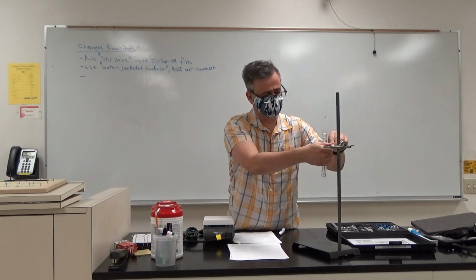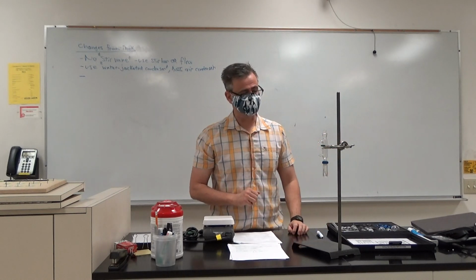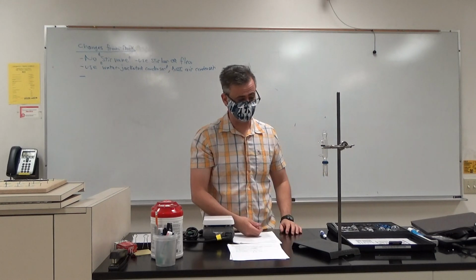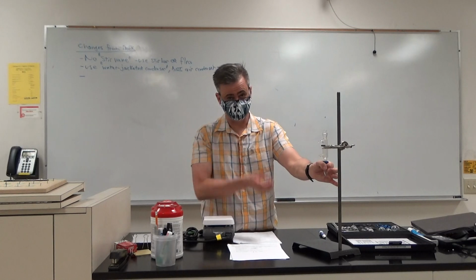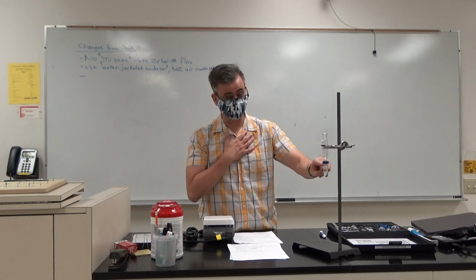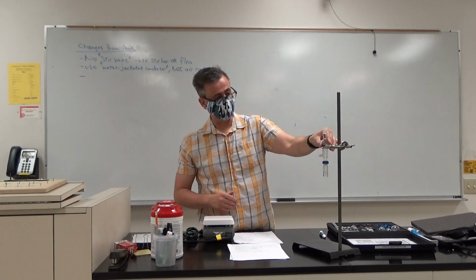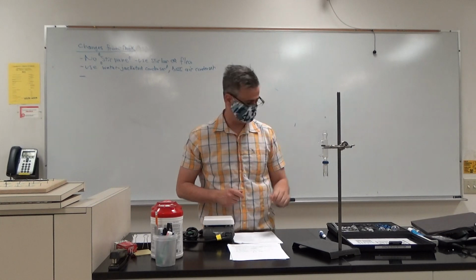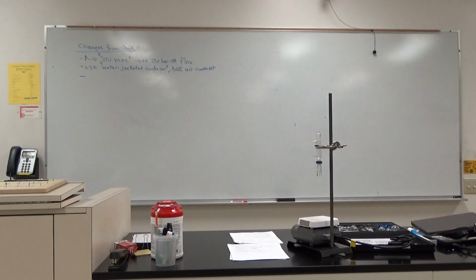And what's cool about this, and a little bit unusual with this glassware, is that I can suspend this reaction flask, okay? Ordinarily, we've got to grab this guy so he doesn't plop into our water bath. But because I've got that black O-ring in there, and I've got this firmly on there, it can be suspended by the water jacketed condenser. Okay? And then I've got my hot plate. Okay. And then I need a beaker.